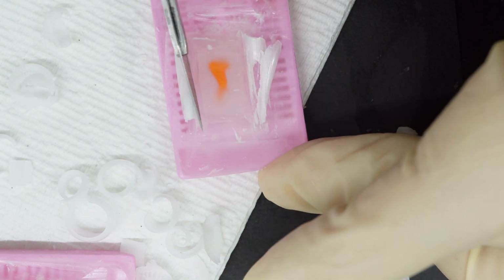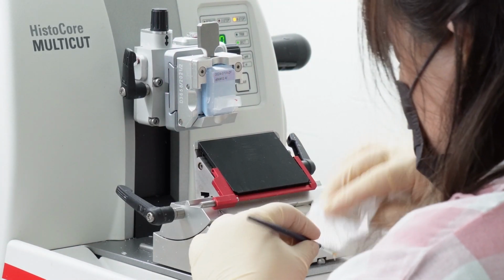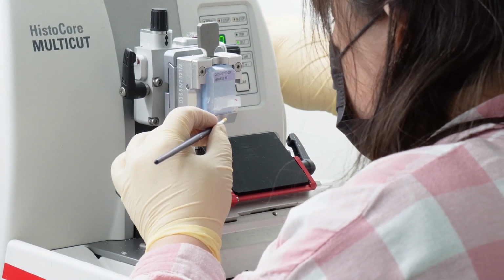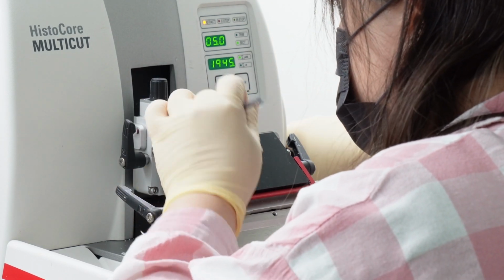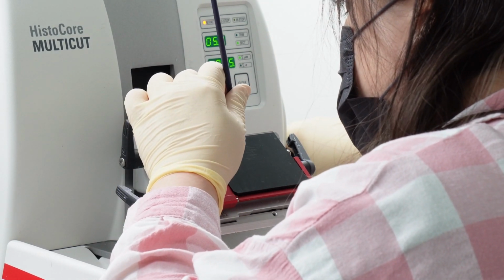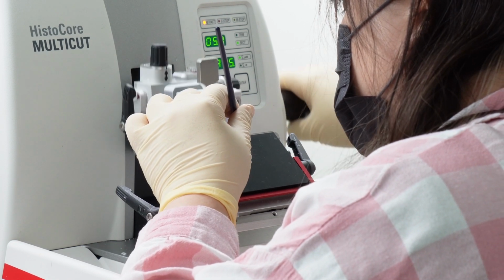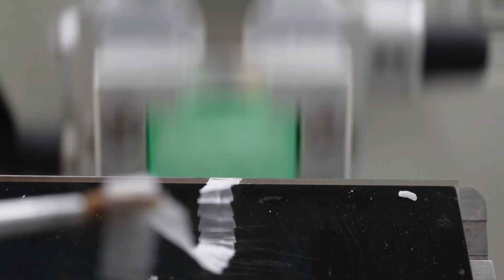Now for the slicing, making those incredibly thin sections. Right. This is where the microtome comes in. It's a precision instrument designed to cut extremely thin, uniform slices from that paraffin block. How thin are we talking? Typically around 5 to 10 micrometers thick. A micrometer is 1/1000th of a millimeter. So yeah, very, very thin.